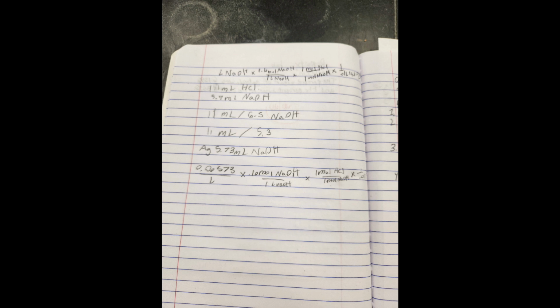So in our first trial, we used 5.4 milliliters of sodium hydroxide. Our second trial was 6.5 milliliters. And our third trial was 5.3, which gives us an average of 5.73 milliliters of sodium hydroxide to complete the reaction. Now we have to do the formula to actually get the molarity of our hydrochloric acid solution.